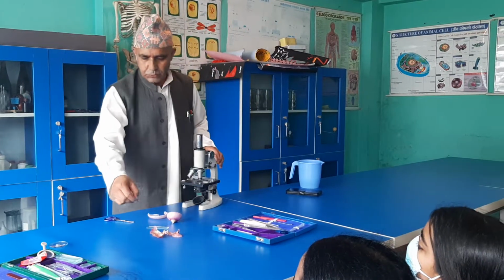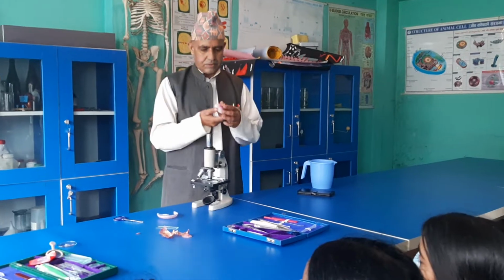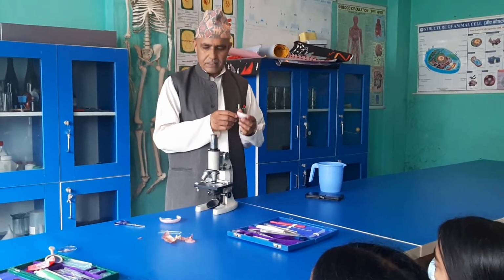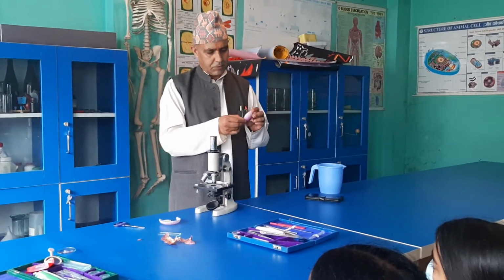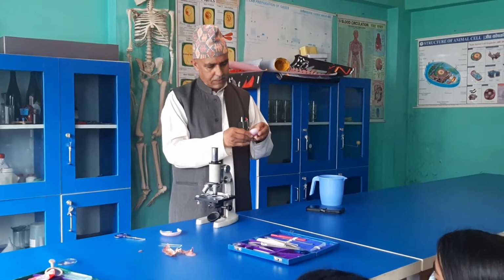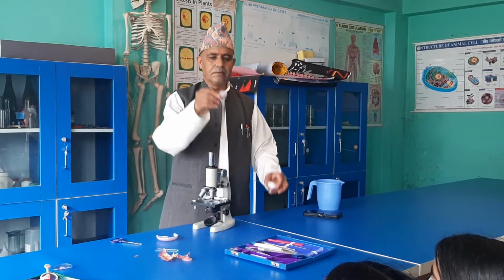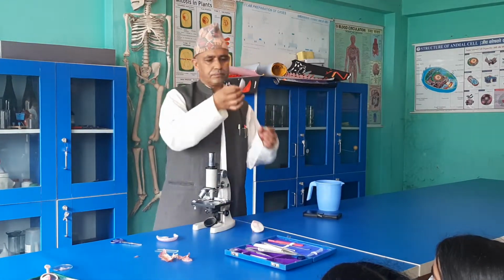To observe or to see onion cells, what do we need? We need one small piece of onion, and from that small piece we have to take out its inner membrane, right? Membrane like inner to it. Like if I simply take out this one.